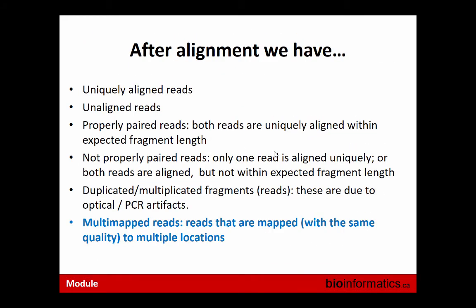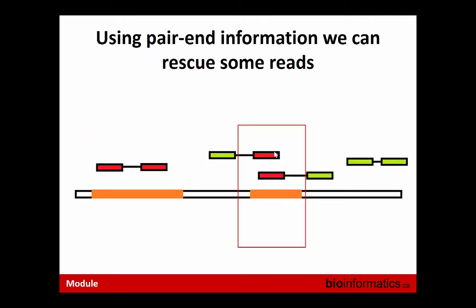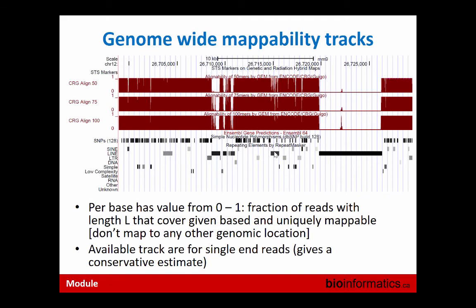Okay, so we were talking about these multi-mapped reads, and they're coming from repeats. We don't really know how to work with them, and unfortunately, those reads are perfectly aligned, but we just put them aside most of the time, unless you have a special question at hand.